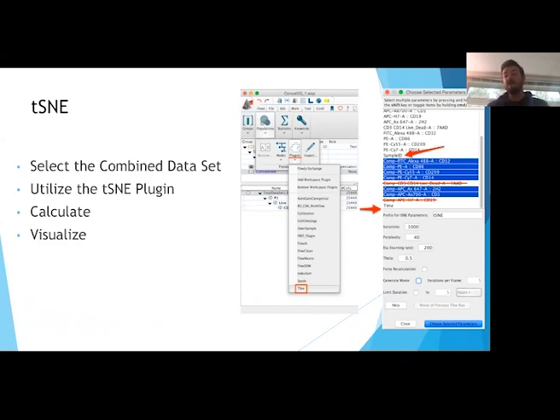I think in some cases you certainly would be concerned with the bias introduced by oversampling from certain samples or populations. If you're looking for exceedingly rare events, it may be desirable to include every last event that you can. So I don't think that there's a hard and fast rule on this, but it is something to be aware of. I was actually going to note this in my tips and tricks.